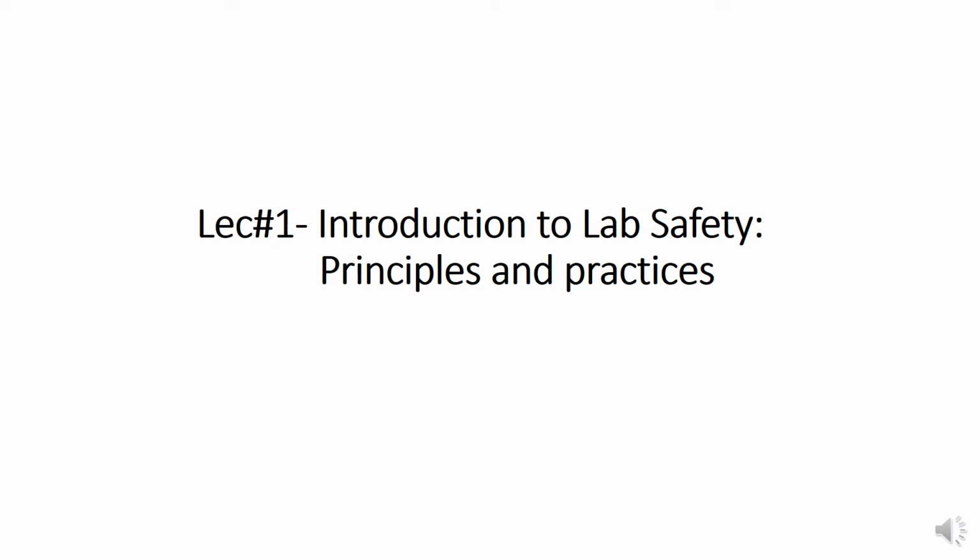First lecture is about the introduction of lab safety principles and practices. This is a very basic lecture. We will cover different terminologies about lab safety, workplace, hazards, principles and practices, etc., and general lab safety.